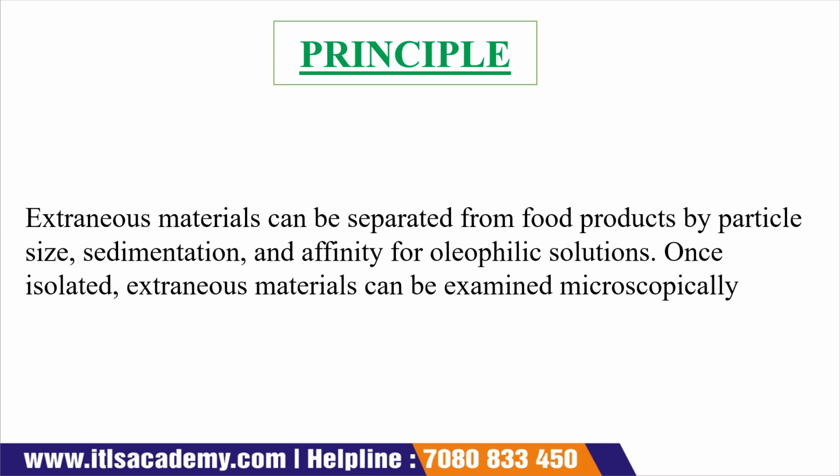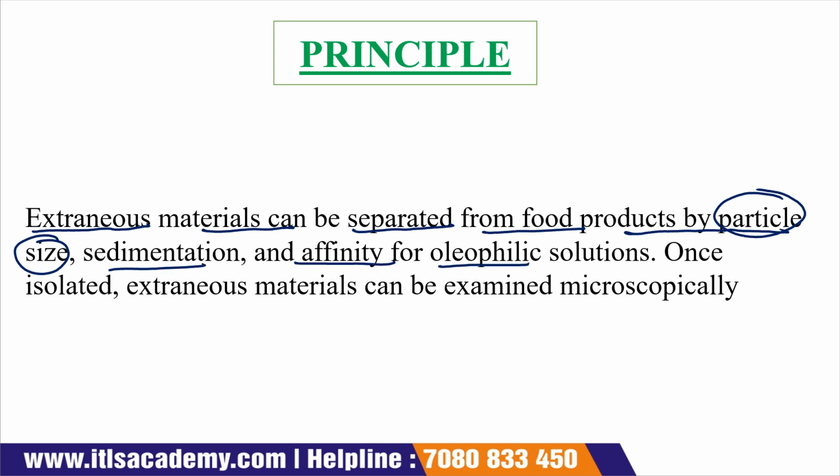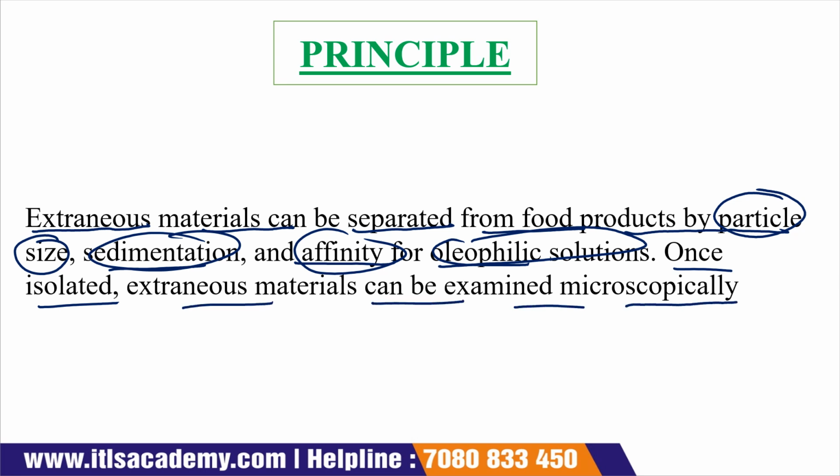Now see what is written in the slide. Extraneous material can be separated from a food product by particle size, sedimentation, and affinity for an oleophilic solution. Once isolated, extraneous material can be examined microscopically.